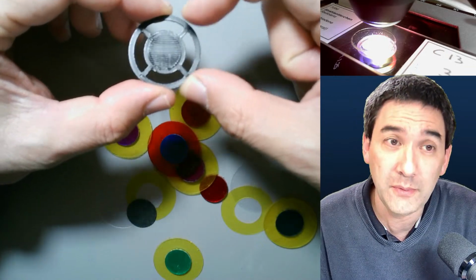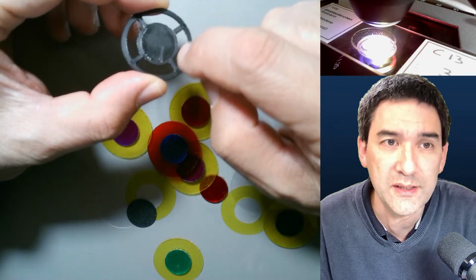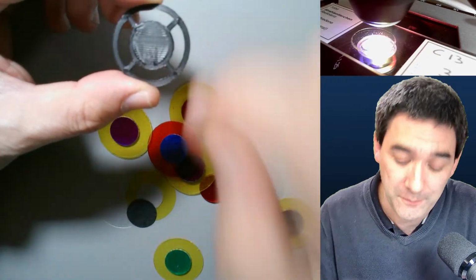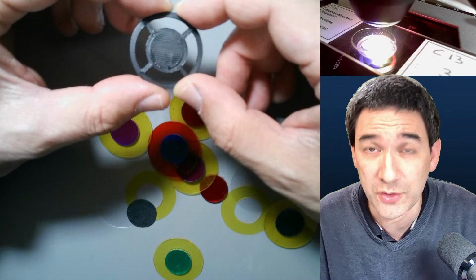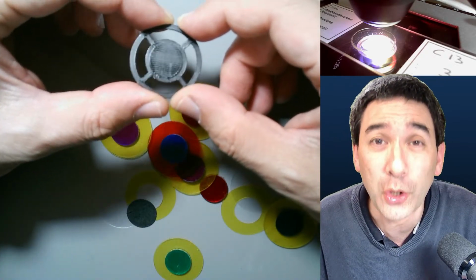Because it blocks a lot of light, the only light that you get is the light that indirectly illuminates the specimen from the side. And if you now go to higher magnifications, 40 times, 60 times, and so on, those are already very dark.